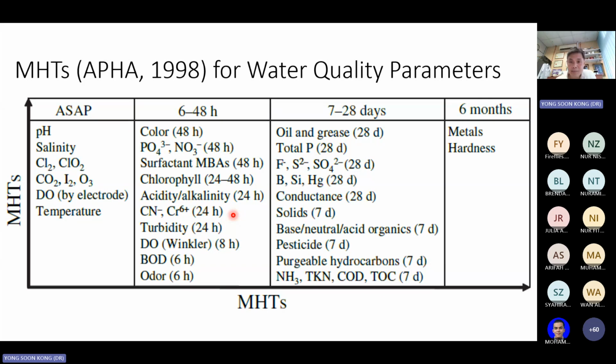Now, the other things that may not be metabolized by microbes, you have a bit more time, but still, the third column right here, you can see most of them, they are organics. They are either unstable because of the effect of the light, or maybe they are volatile. So here you go. Maximum holding time, they are also subjected to a proper QC.